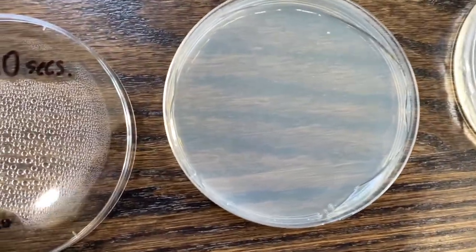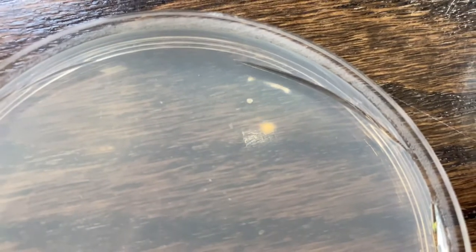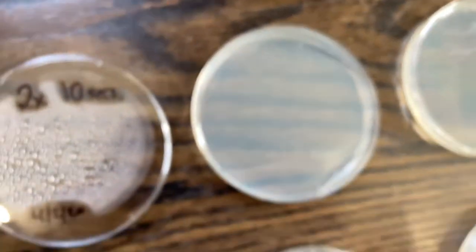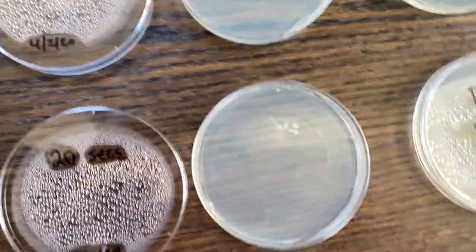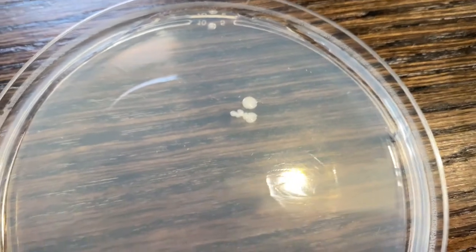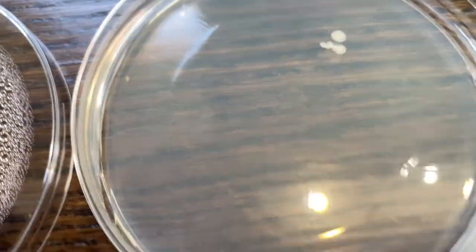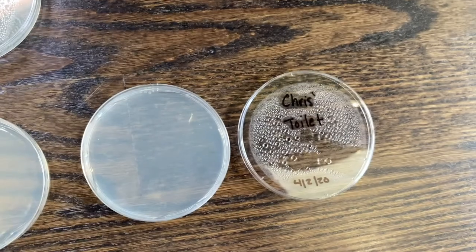So our results: after two times of washing our hands for 10 seconds, there is just this tiny little spot — I'm not sure what it is, but I'd say 99.99% clean. And the 20 consecutive seconds one — there is also a small little thing in there, it looks similar to the other one. If anyone knows please let me know in the comments below. Our hypothesis holds true — it works about the same. Thank god.